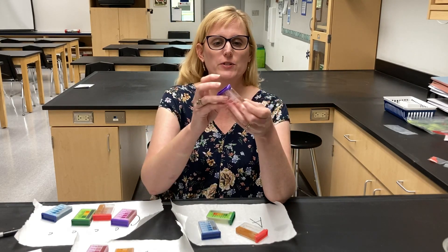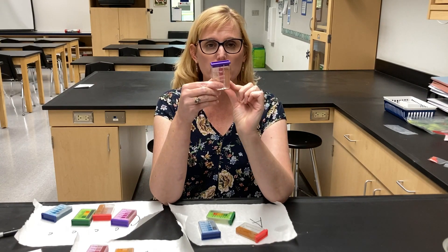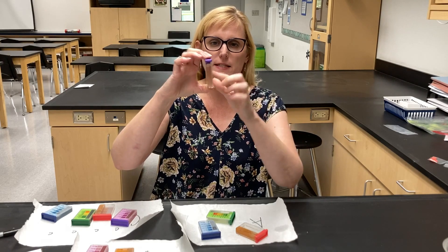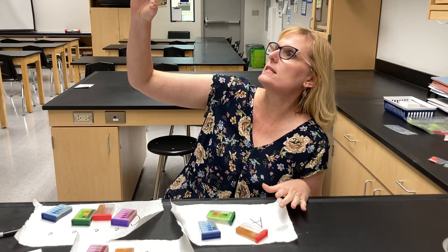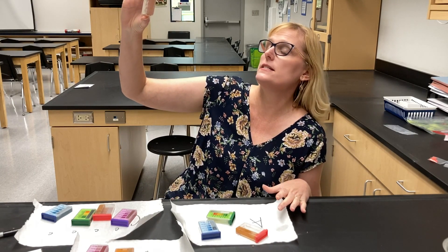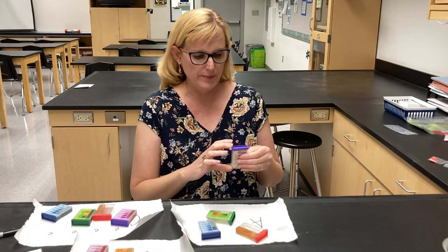So sample A — I'm very surprised knowing the source of the sample that it has very little nitrogen in it. There is a color change here and when you hold it up to the light you can see it, and in my opinion it is deficient, almost depleted. Write that on your data for nitrogen.